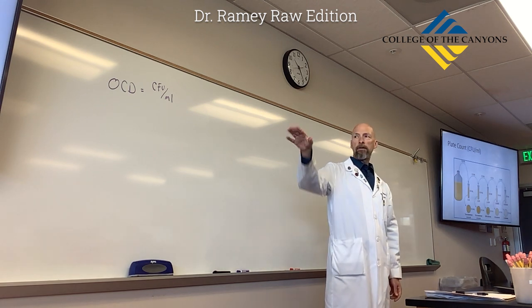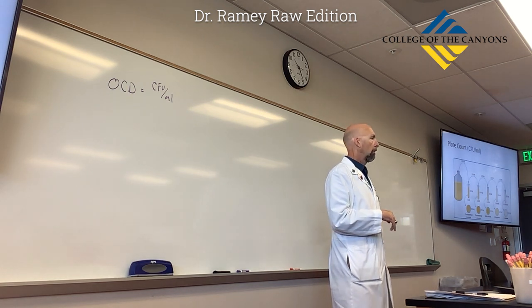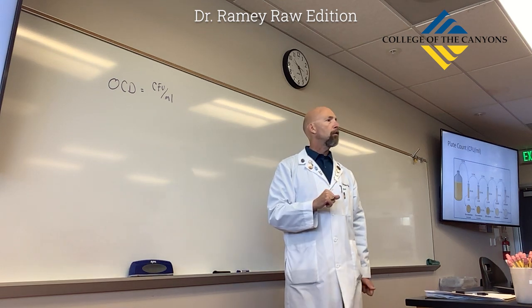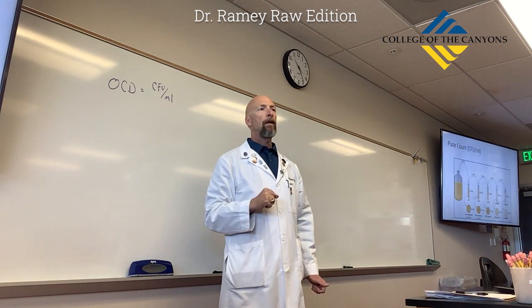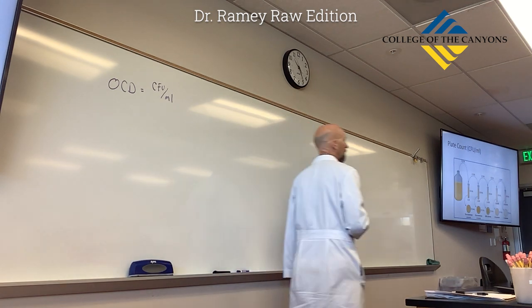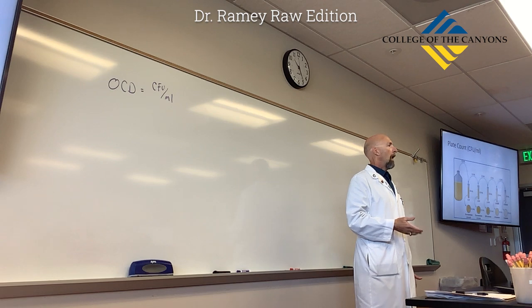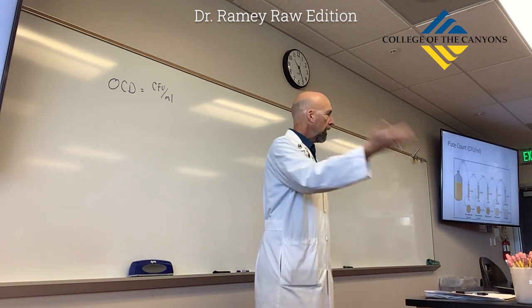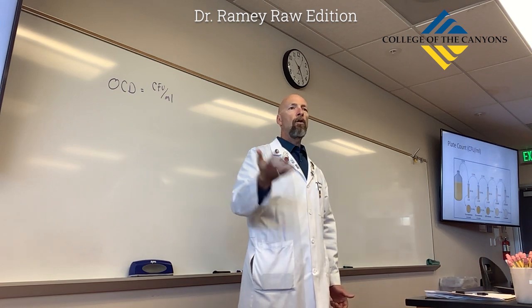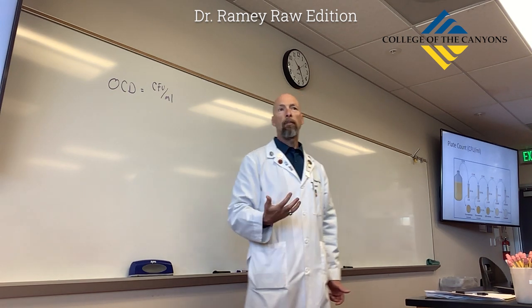So you can see that there's that original moonshine jug culture, and then there are 5 dilution tubes. And then after you complete the serial dilution, you're then going to take an aliquot, a small volume from each of the dilution tubes, and use that to inoculate a plate, which then you'll incubate, and then after incubation, you will evaluate the plate and count the colonies on some of the plates.